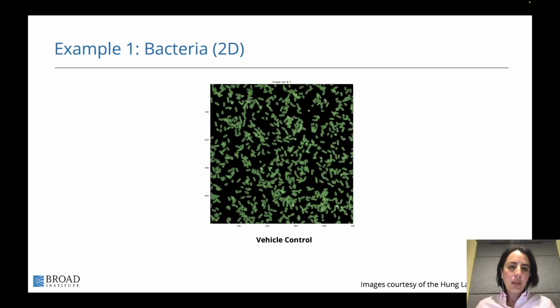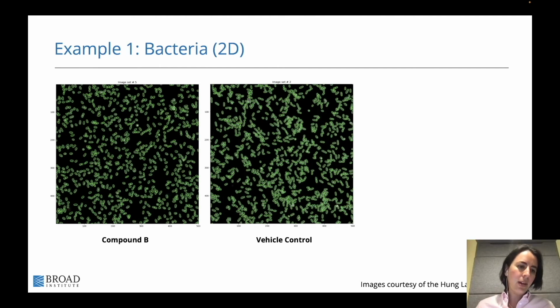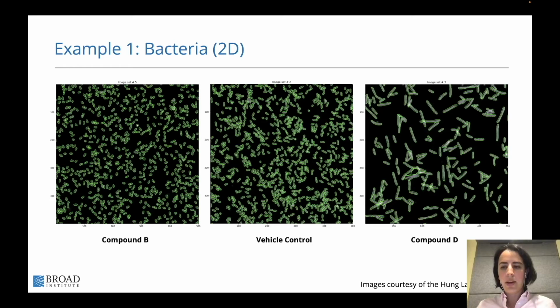And so I can show you again for this pipeline, when we have the normal bacteria, even the smaller bacteria, it does really good, and the elongated bacteria it does an awesome job at segmenting, which really improved our pipeline.